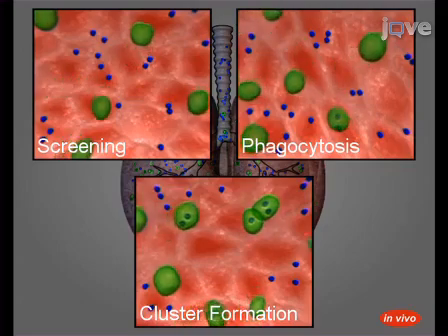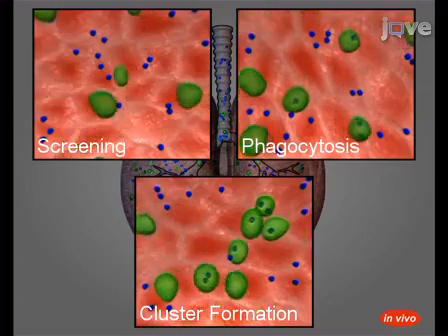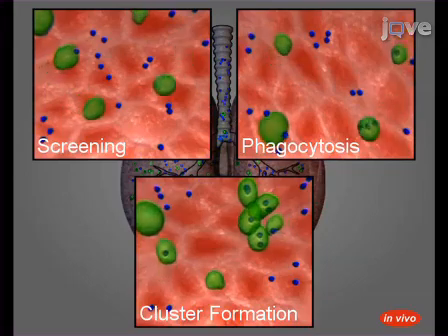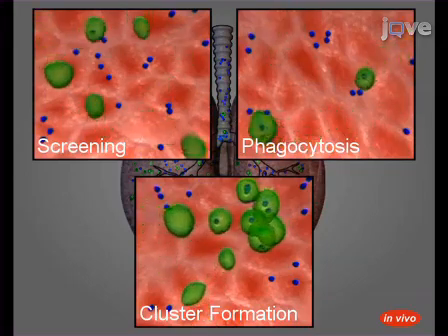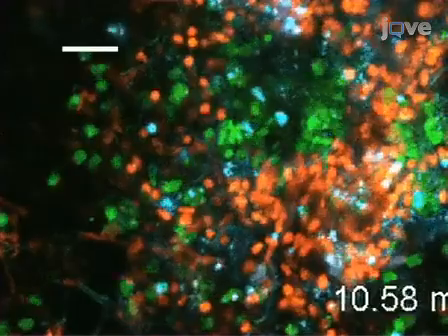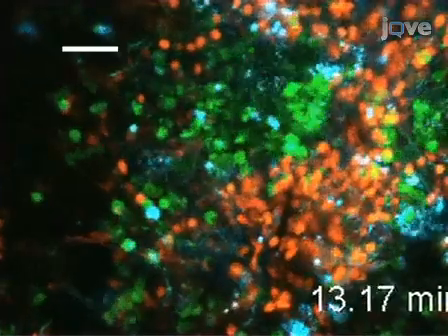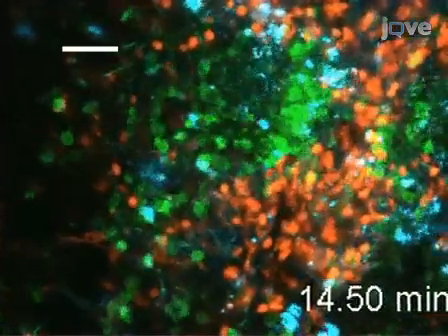Neutrophils, in green, can be seen migrating and phagocytosing fungal elements, in blue, in Aspergillus-infected lungs, as seen by time-lapse two-photon microscopy of a living lung slice 7 hours after infection. Cell nuclei and net structures are depicted in red. The real time of the experiment is shown on the lower right, and the scale bar is indicative of 50 micrometers.